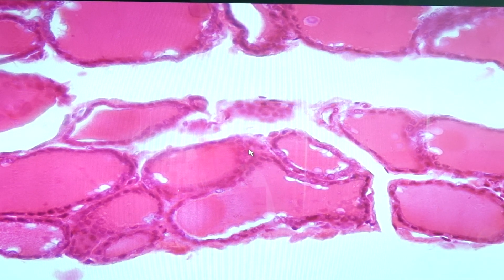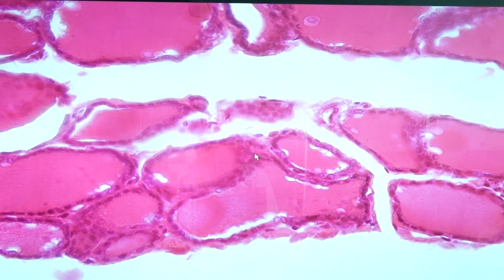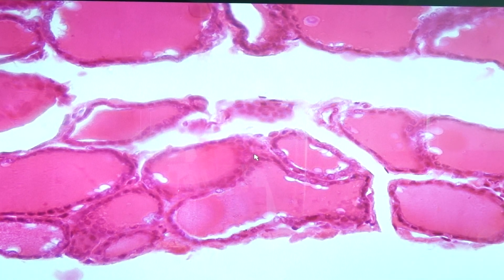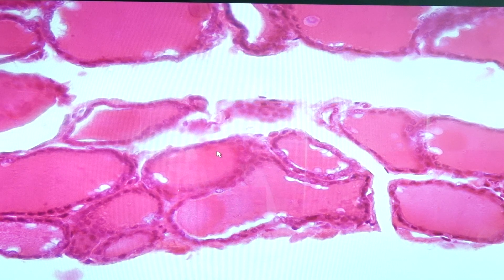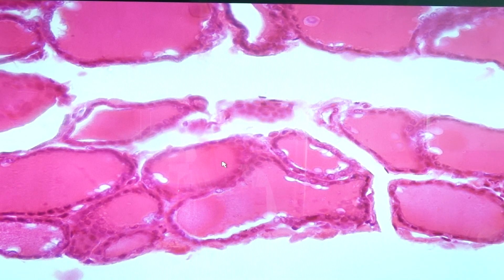The parafollicular cells secrete calcitonin, which counteracts the action of the parathyroid hormone — that is, it works against increasing calcium levels. The colloid, found within the follicle or follicular lumen, is acidophilic and contains thyroglobulin, which is the inactive storage form of the thyroid hormone.